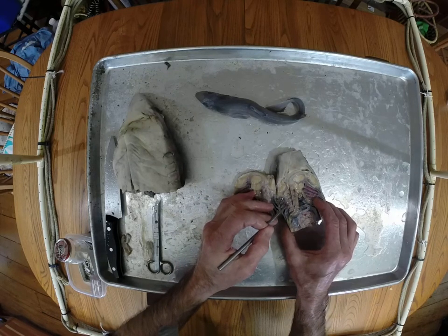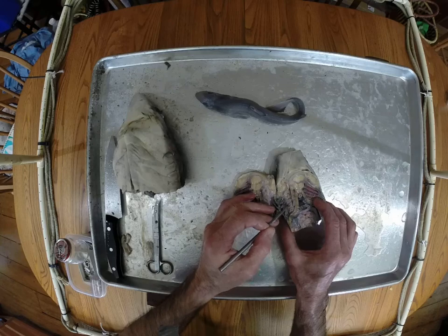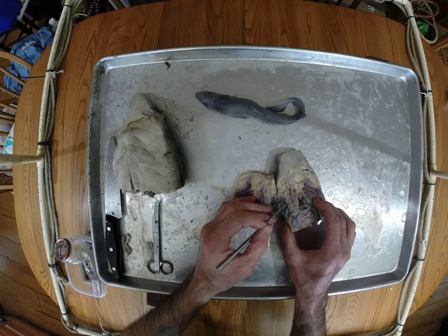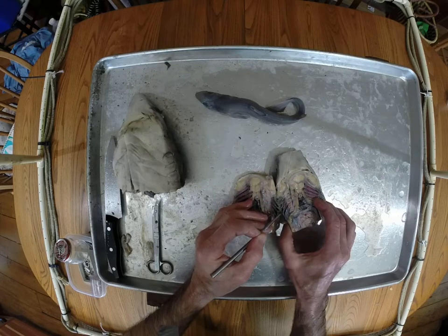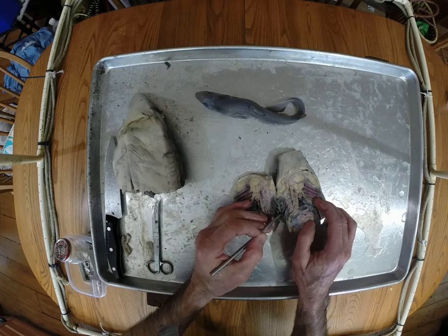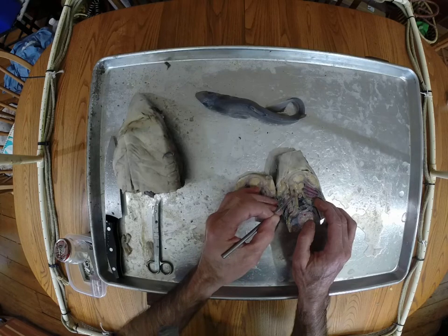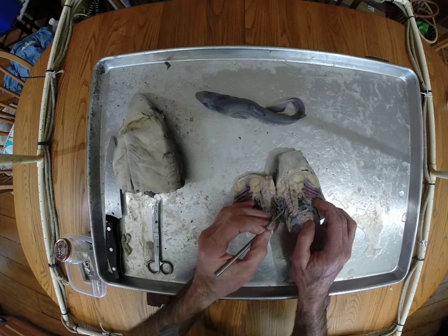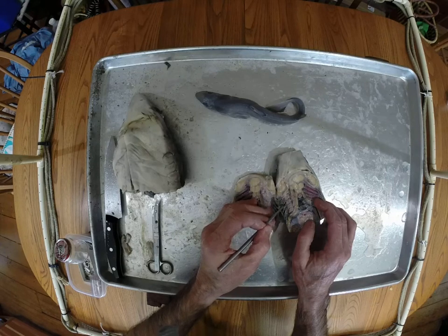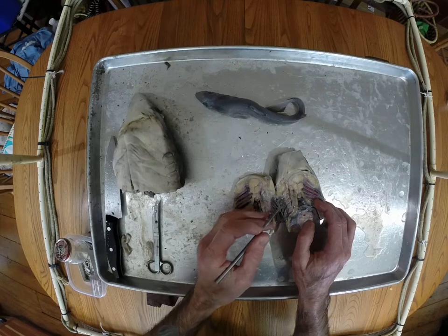So here are those gill arches, 1, 2, 3, 4 that have gills, complete holobranchs on them. And then you can see the interbranchial septum coming out here, forming a valve on the exterior of the fish so that water can't flow back this way. Water can only flow out. And then a hemibranch on this side, a hemibranch on that side of the interbranchial septum.